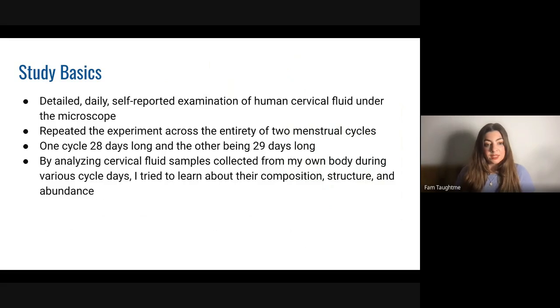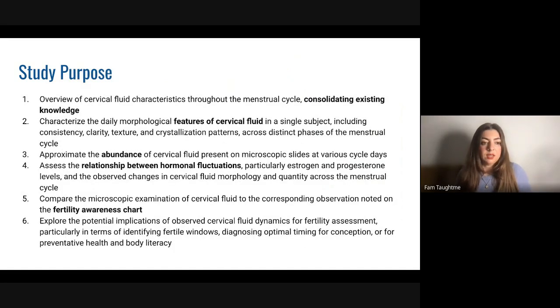And by analyzing cervical fluid samples collected from my own body, I tried to learn about their composition, structure, and about how much of them I was making during each day. And the purpose was sixfold, right? So I had a lot of questions.